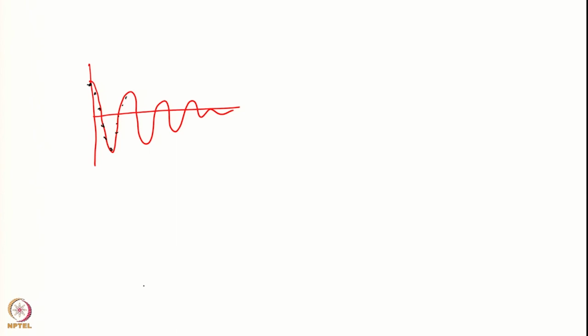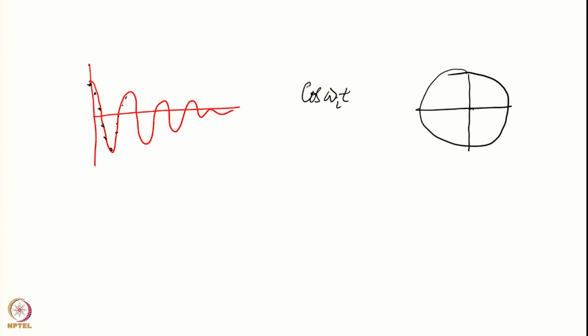So therefore at time t equal to 0, the magnetization is entirely along the y axis, if I am collecting the y components. But suppose I cause a small delay in the acquisition of the time. So in this situation, where will the magnetization be? All the components of magnetization will be along here, in the normal case.